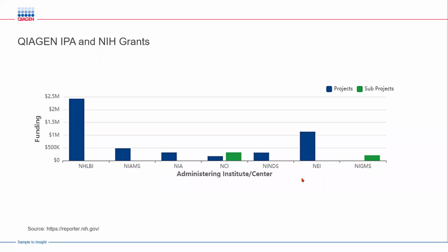So we can see a lot of applications when it comes to IPA. You can publish papers, write review papers. You can even generate hypotheses just for your grant writing.